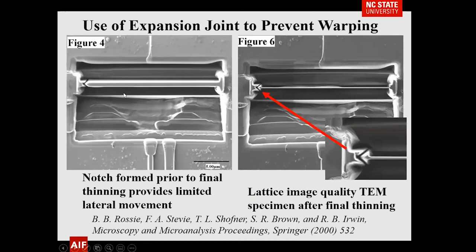If you work with metals and prepare a long section, as you thin it you're removing stress from the material, which risks the section warping. We have seen this occur in a number of examples. What Ben Rossi developed was an expansion joint. Like the expansion joints on the Golden Gate Bridge — estimated to move about 20 feet up and down during the day due to temperature change — this expansion joint allows you to thin the section and any stress in the material will be relieved.